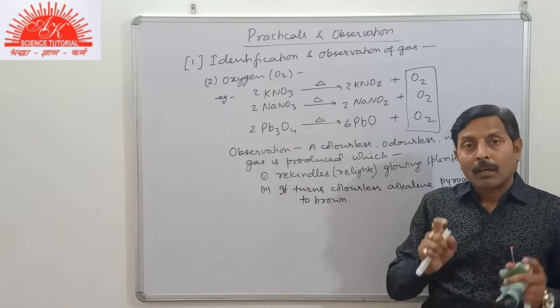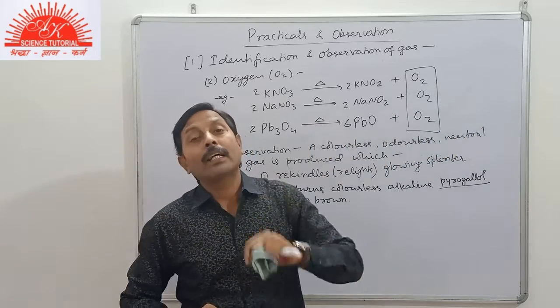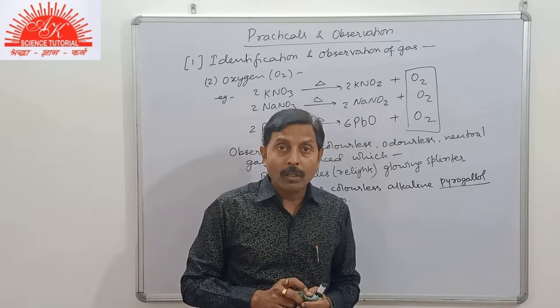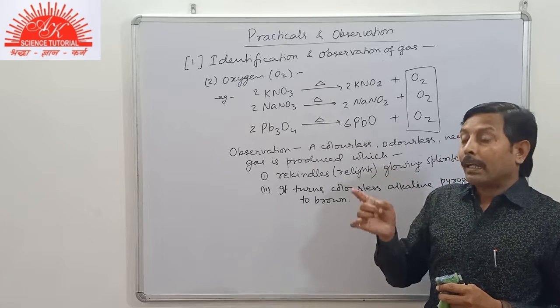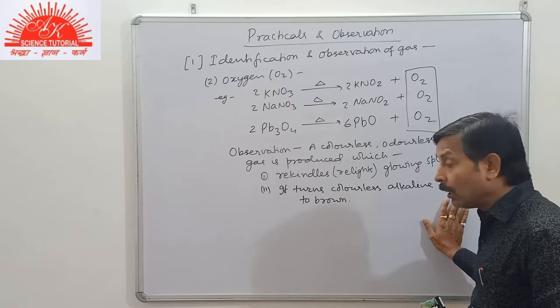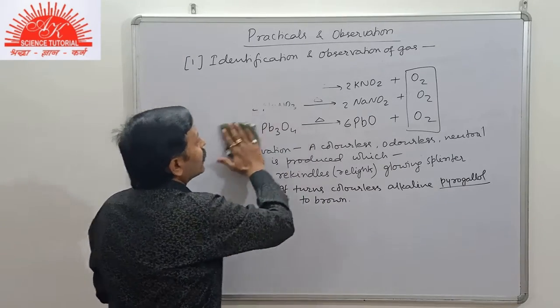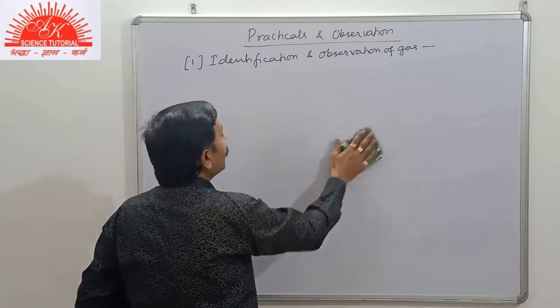Oxygen is a colorless, odorless, neutral gas which rekindles or relights a glowing splinter, or a colorless neutral gas which turns colorless alkaline pyrogallol to brown. So this is the test for oxygen gas. Now students, we have studied two gases. Now come to the next part.